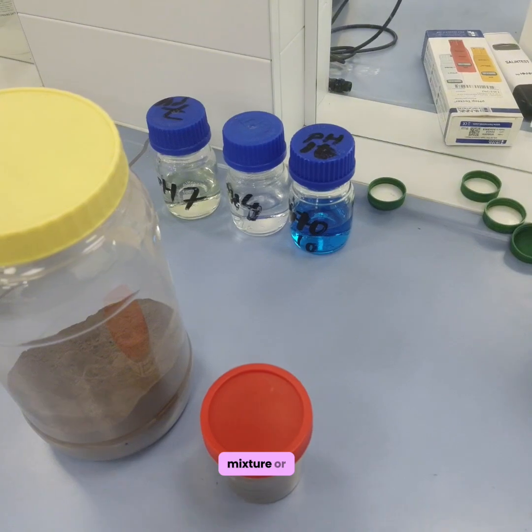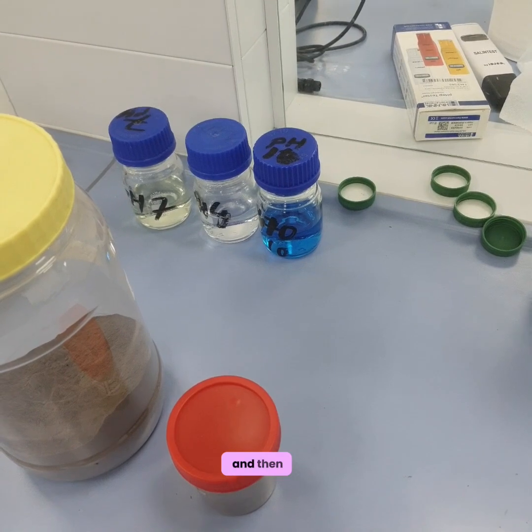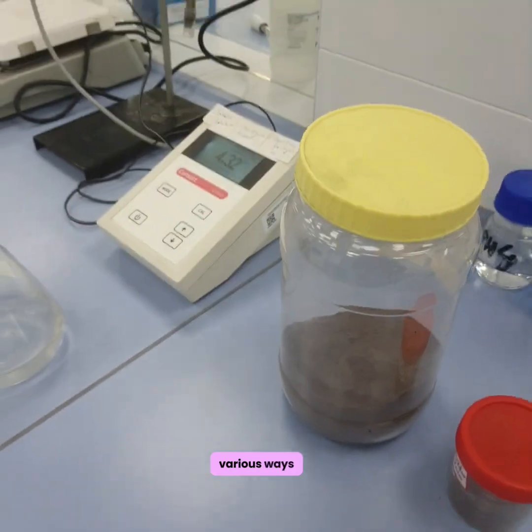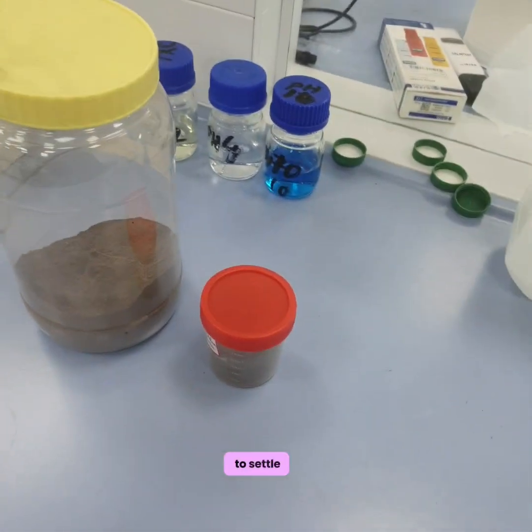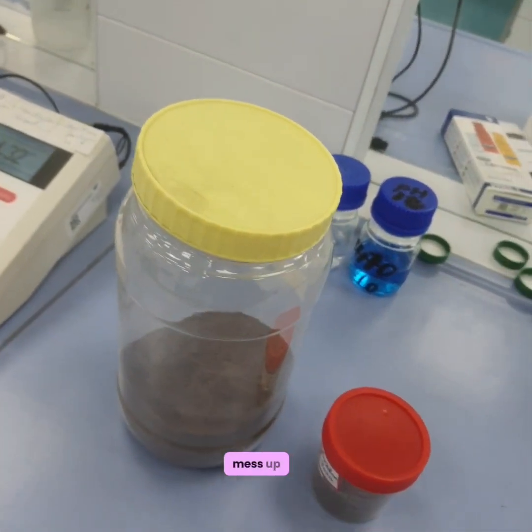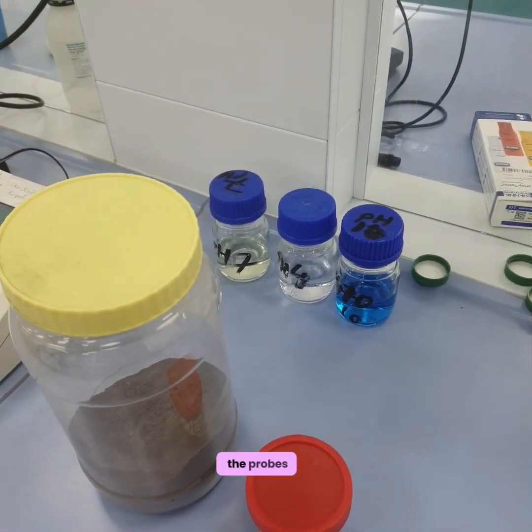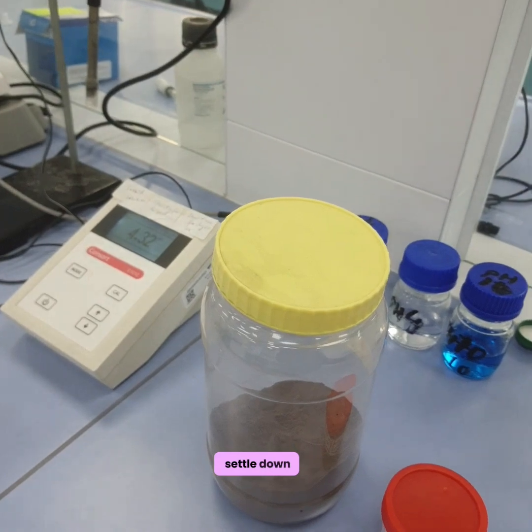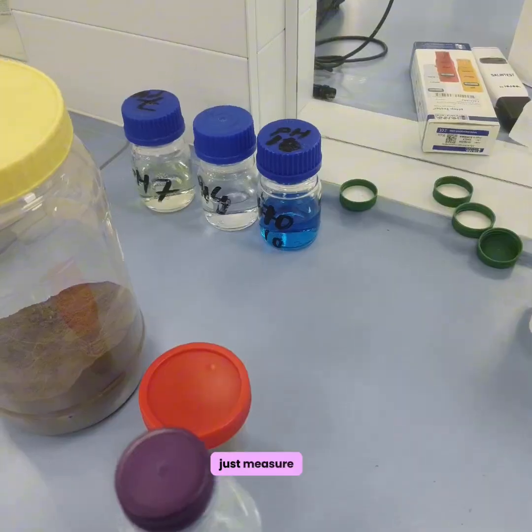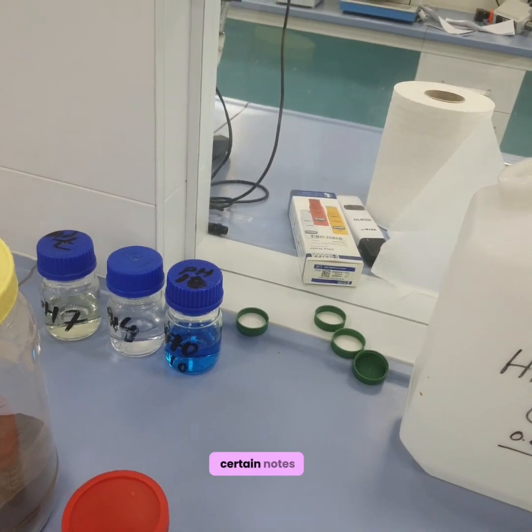the mixture for about 5 minutes, and then we will allow it to settle down. There are various ways. Either we can allow the sample to settle down, or we can centrifuge, or we can filter, so that the probe doesn't interfere with the solid samples and the solids don't stick to the probe. Let's suppose this is a liquid solution here, so we can take the supernatant and just measure its pH. Usually the settling time is around 15 minutes, and there are certain notes to be taken.